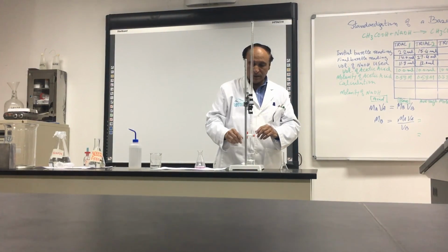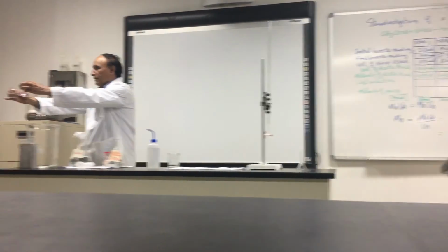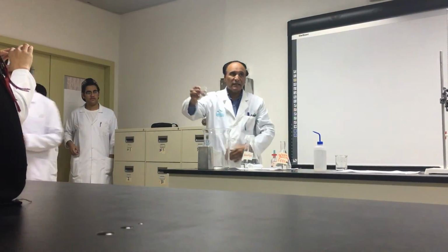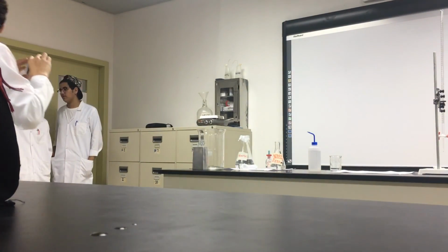Alright? So look, the sodium hydroxide is finished over here. Can you please, any one of you, wash both of them? Wash both of them with the water. This is sodium hydroxide. This sodium hydroxide you can put back over here, and wash it.